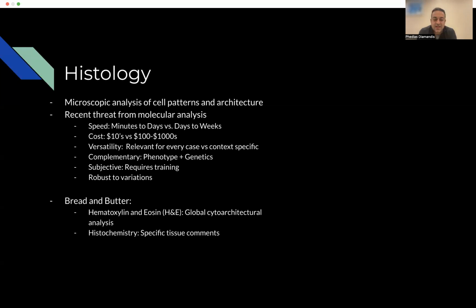One example of a histochemistry stain that we do often is reticulin. Many tumors are reticulin rich, whereas others are reticulin poor. And so the presence or absence of reticulin can help differentiate tumors that may be on the differential diagnosis, but have different chemical properties. Schwannomas tend to have a lot of reticulin. Meningiomas tend to form these syncytial bonds between the cells that are depleted of reticulin. So there, we're not so much interested in the structure, but rather the presence or absence of a specific cellular component.